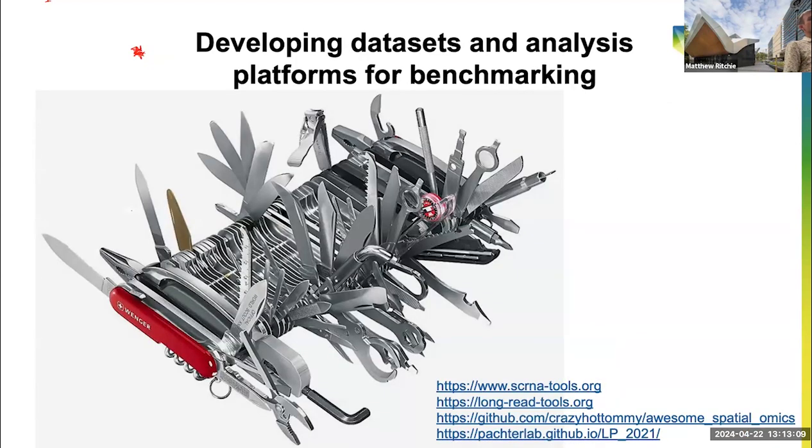So with all of these platforms, life can get quite complicated. For every new sequencing-based platform or spatial platform, there probably won't be one, there might be multiple. And then for every different analysis task for that platform, there might be a multitude of different tools that you can use to do that analysis.